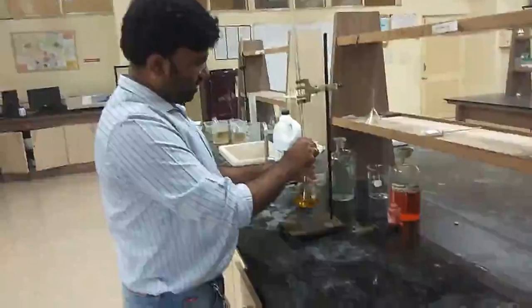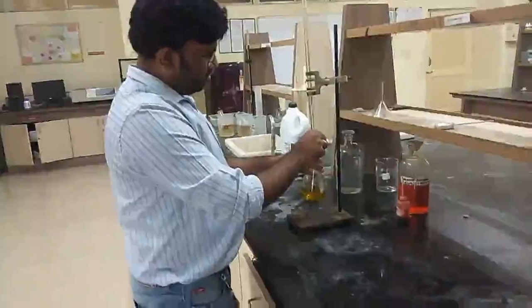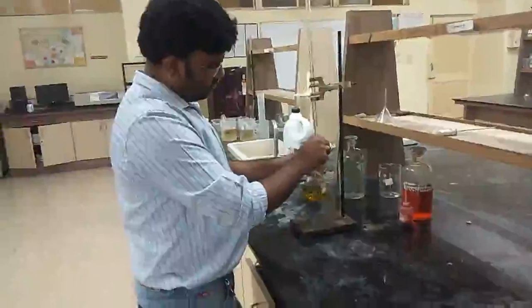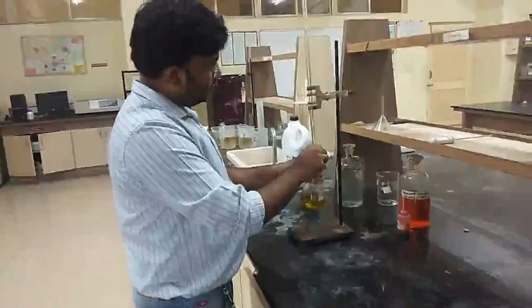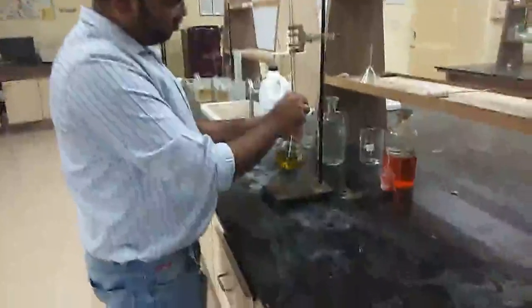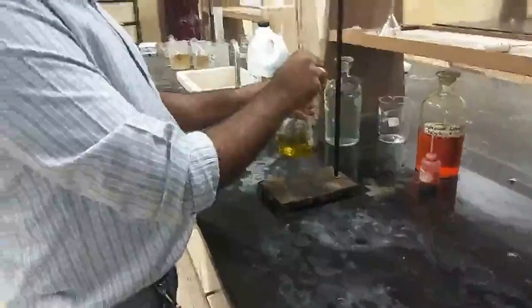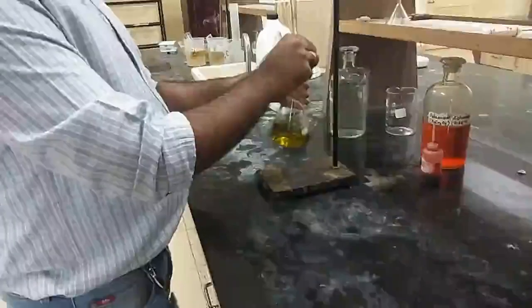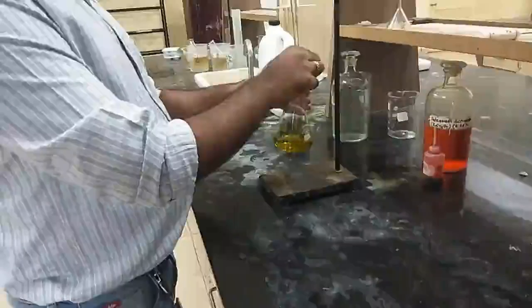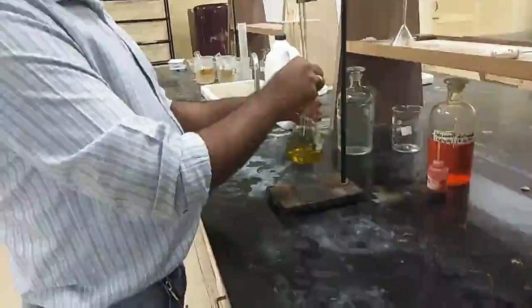The color that we require is stable brown color. The value of this ml of titrant will be noted as A, because this is of blank.